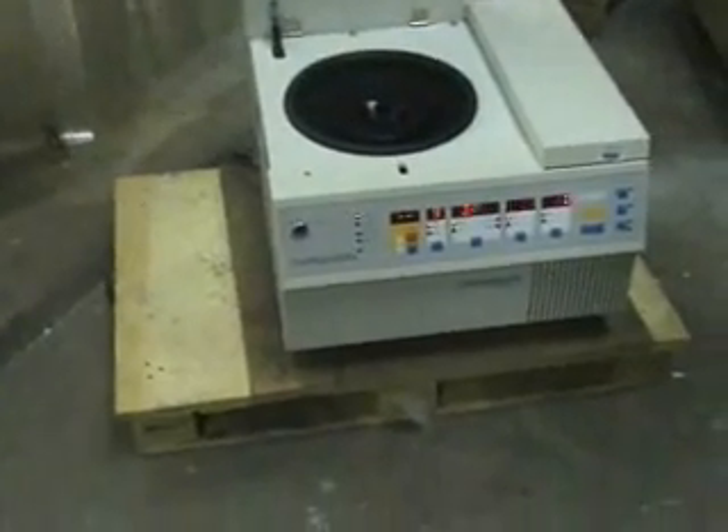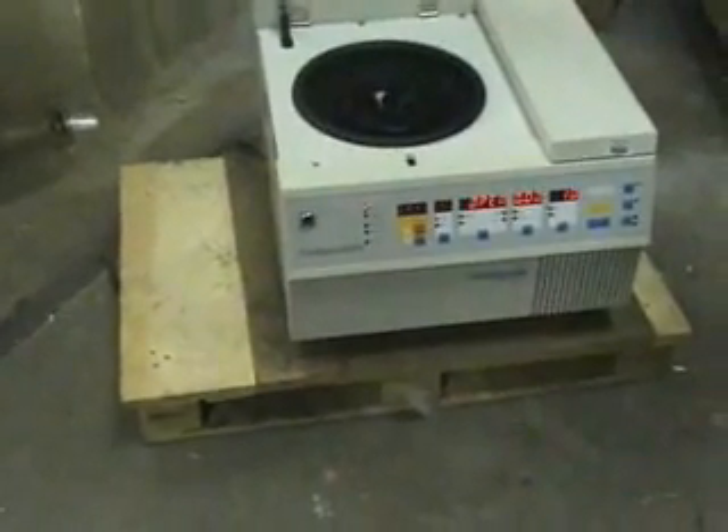Welcome to HiTechTrader. This is the Heraeus Hepatec 28RS centrifuge. Starting off with a rotor — it's an 8-place 50ml rotor.